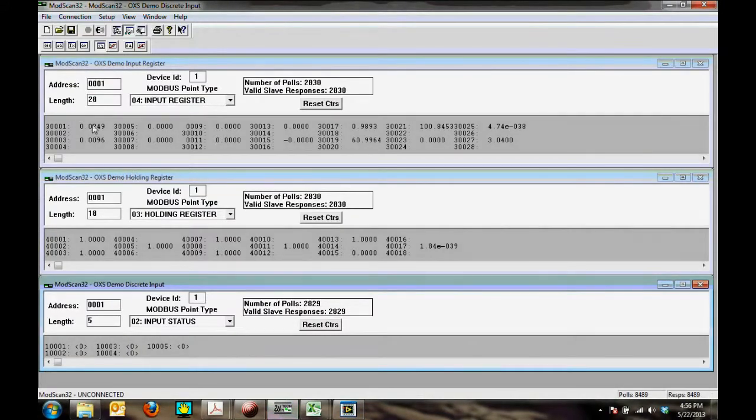As you can see, since we're running the ambient air right now, all of the methane, ethane, and the different reading channels are all 0. But as we switch the valve back over again to the verification gas, you can see all of the values start to rise, to change, all in real time. As shown right here.